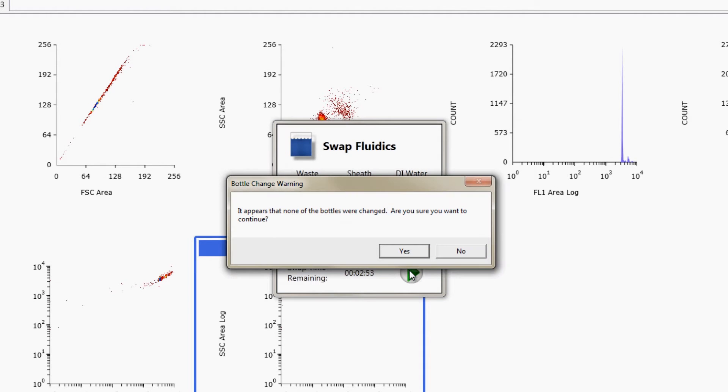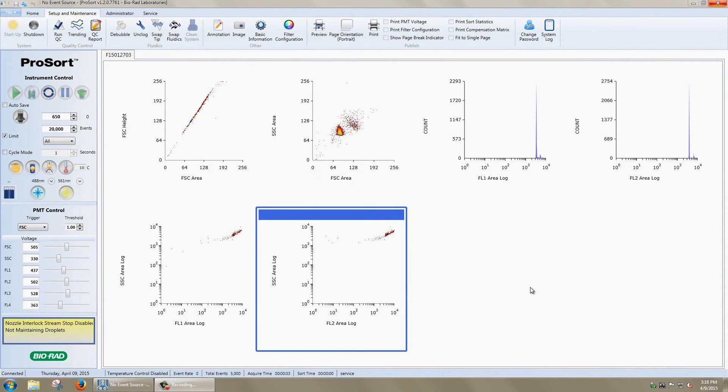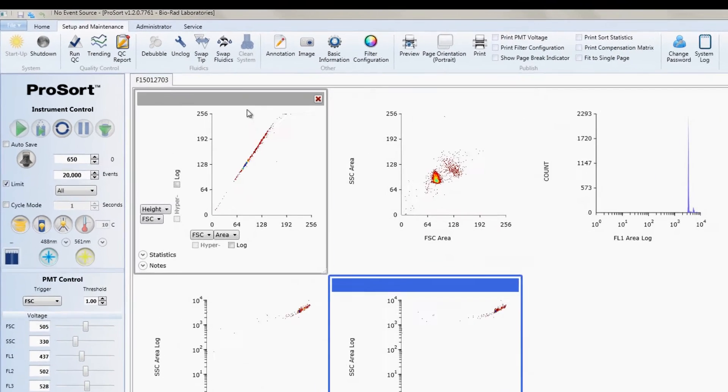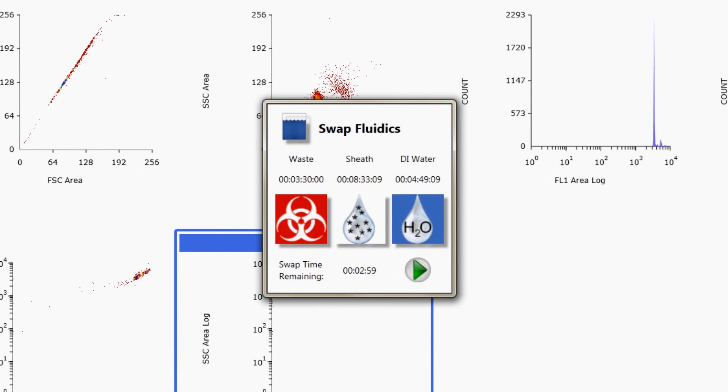If you haven't prepared your bottles in advance, click the green arrow. The software will detect that you haven't swapped the bottles and ask if you are sure you want to proceed. Clicking Yes will stop the timer so you can continue your run while you prepare your new fluid bottles. Once you have everything in place, you can click the Swap Fluidics button again to restart the hot swap timer.